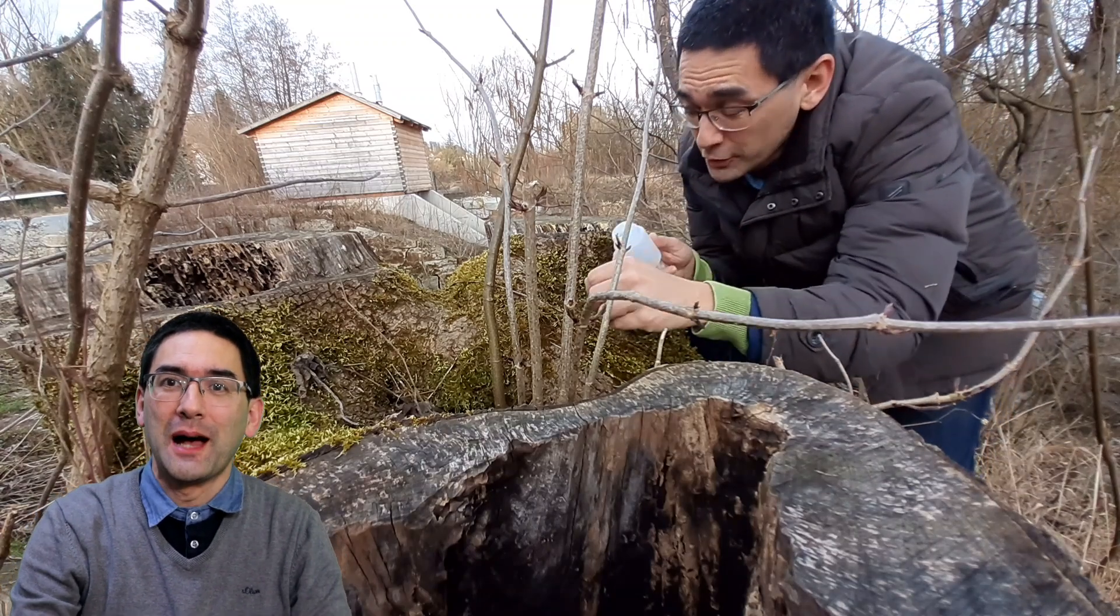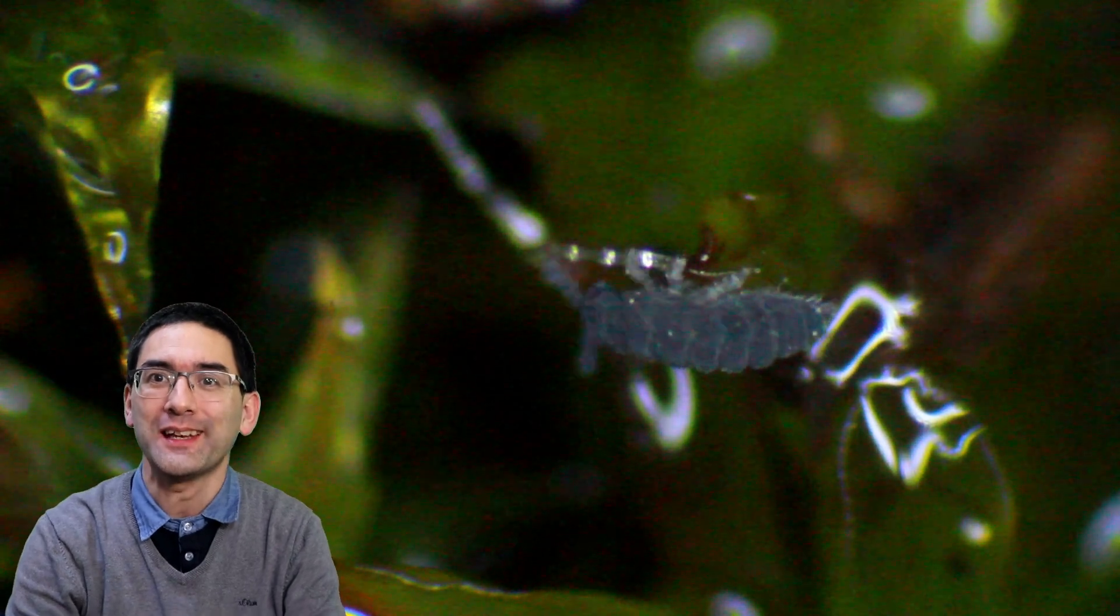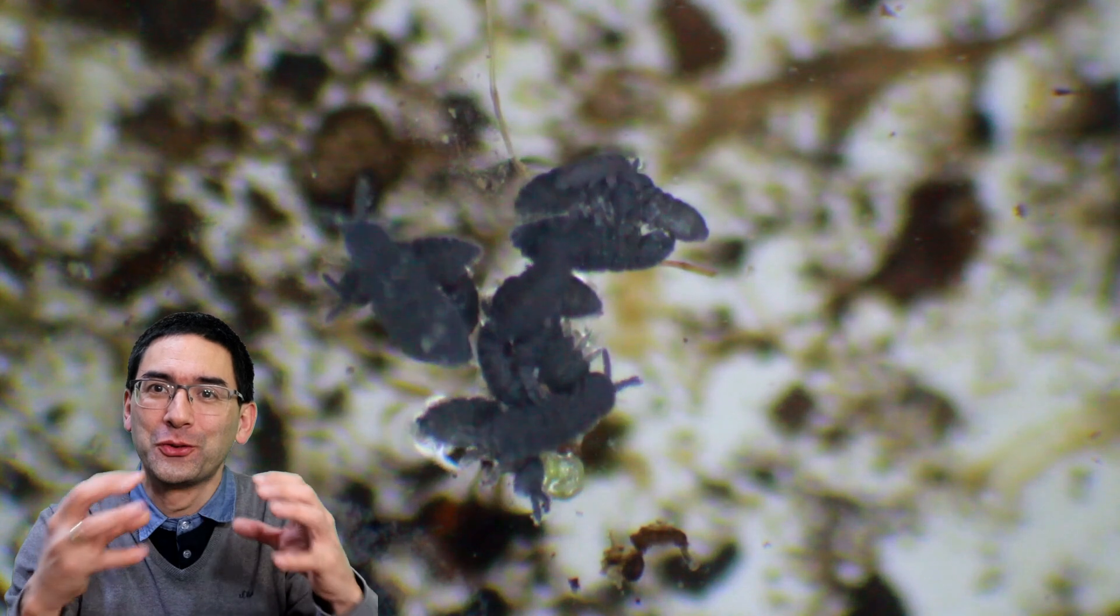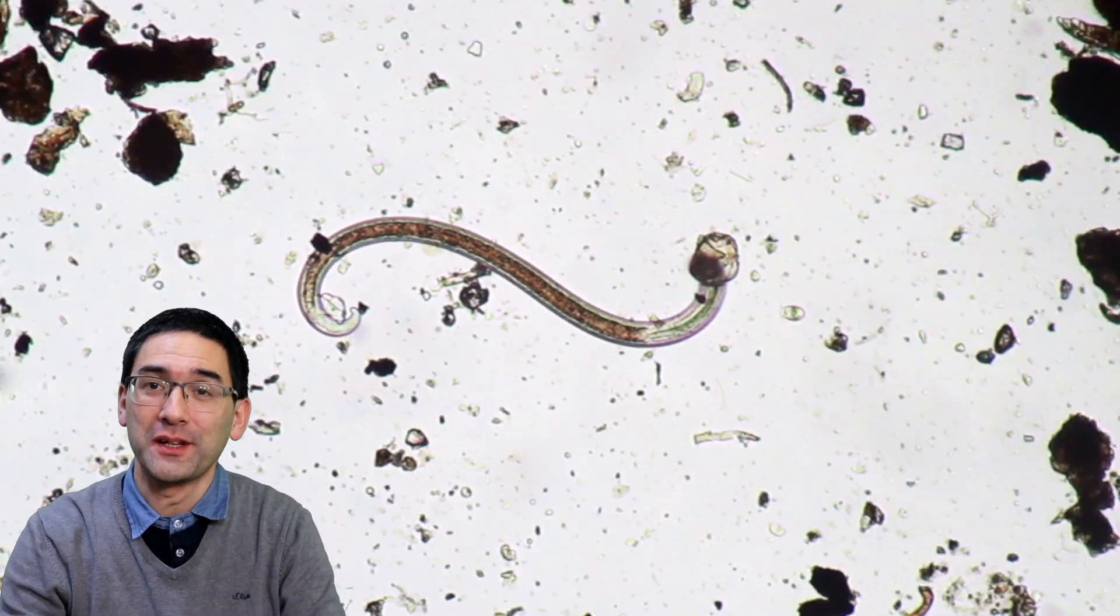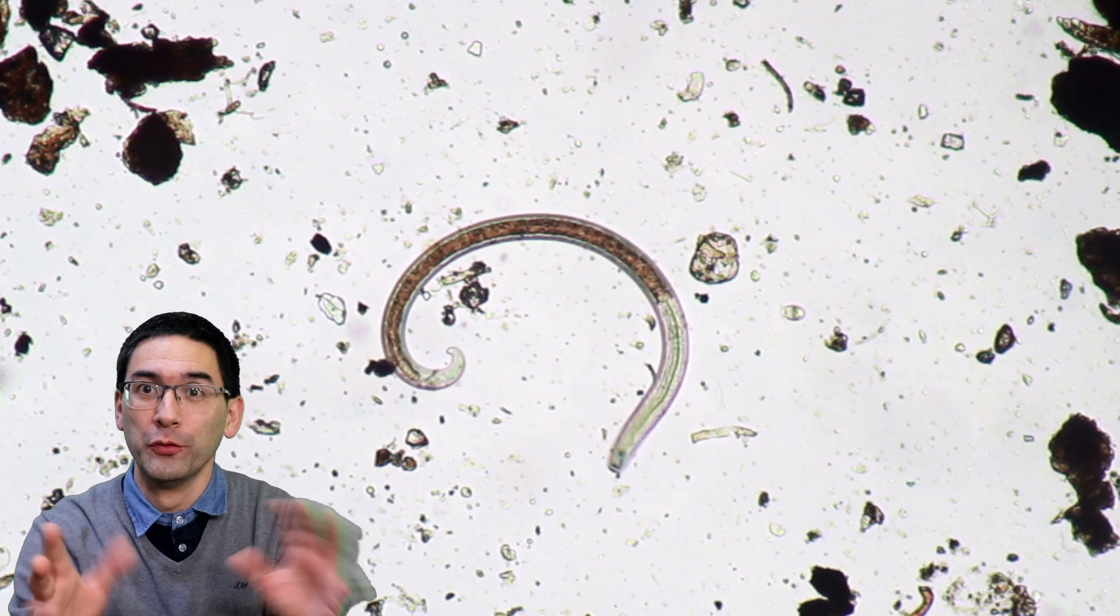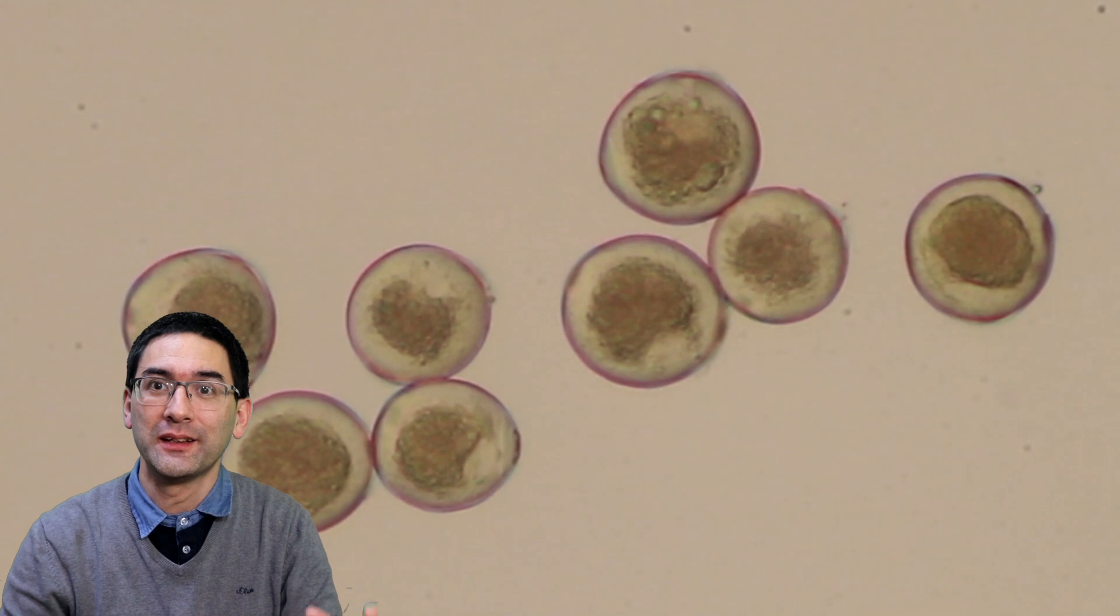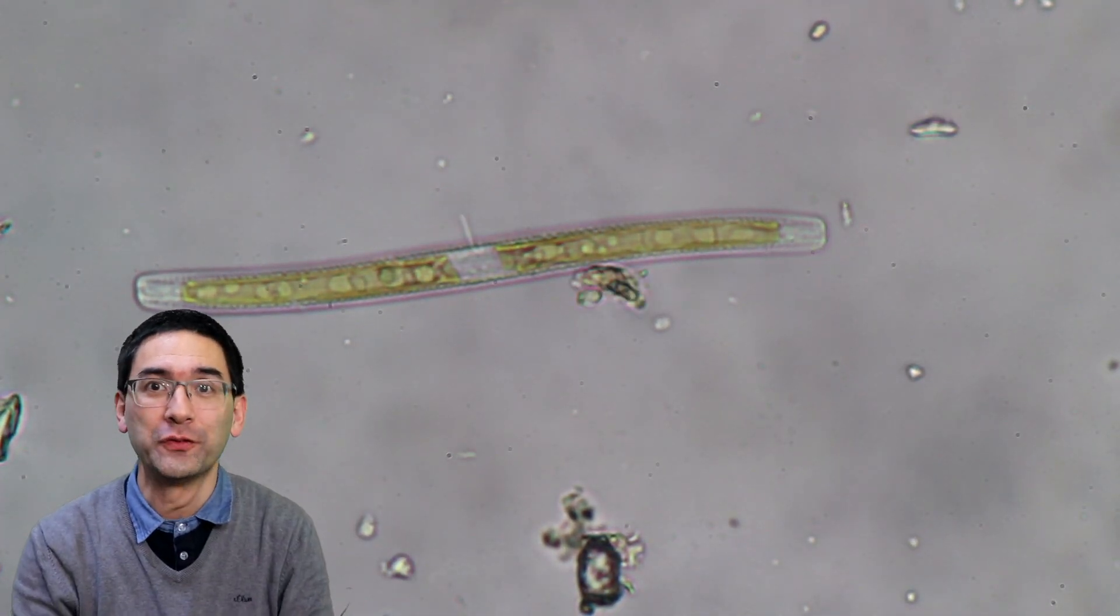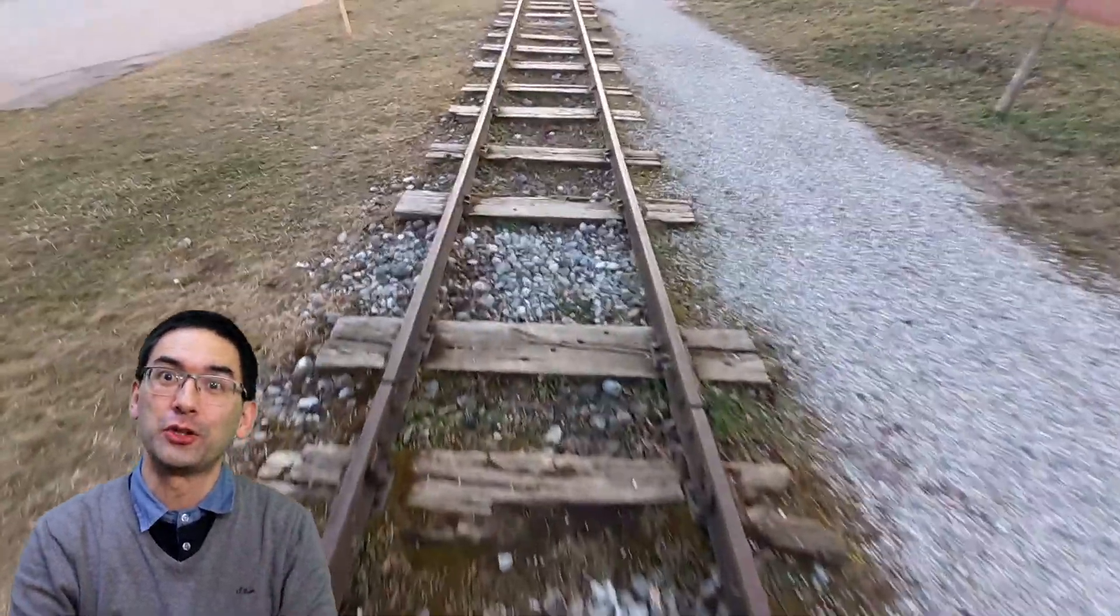Here you see me collecting some samples for microscopy. I found a whole bunch of insects in the moss that I collected. Here you see a few of them clustered together on the surface of water. I've also got some worms that I found moving around, very interesting pollen grains, and of course a whole bunch of diatoms. Where did I find them? Well, next to this train track here.